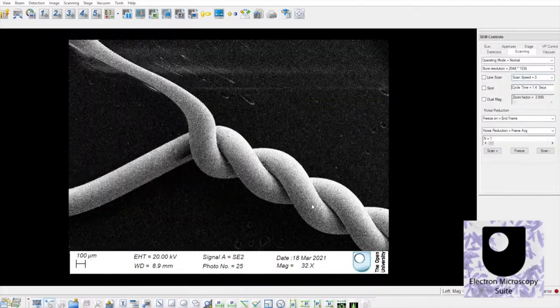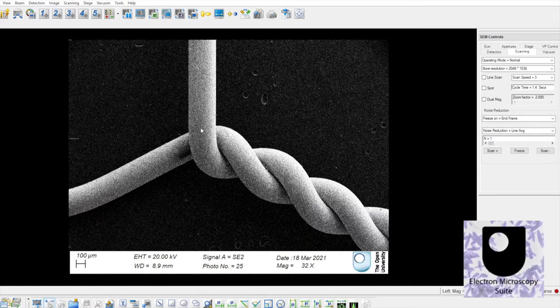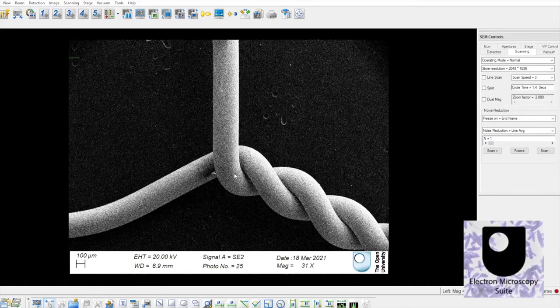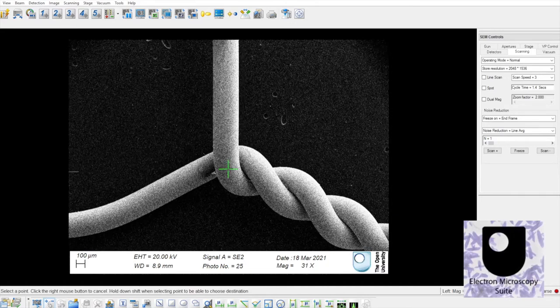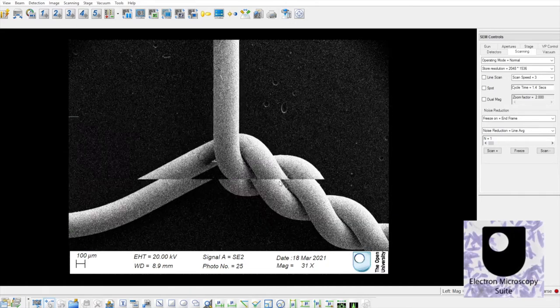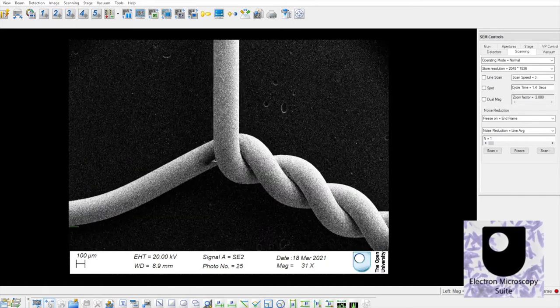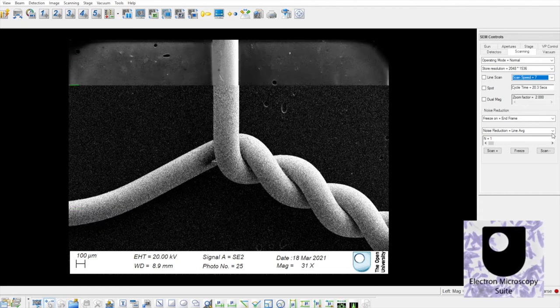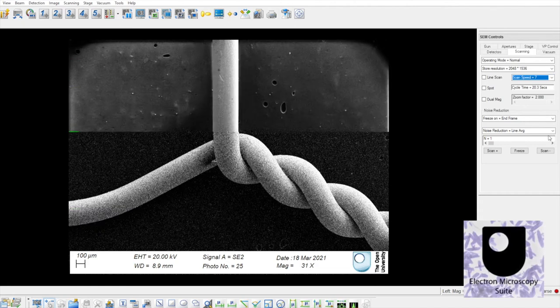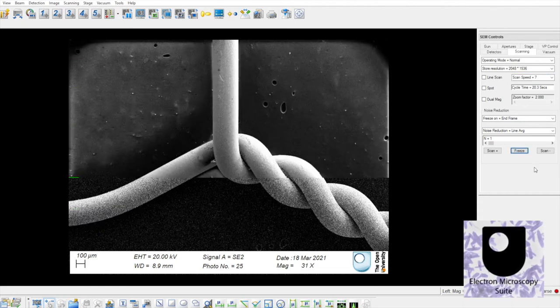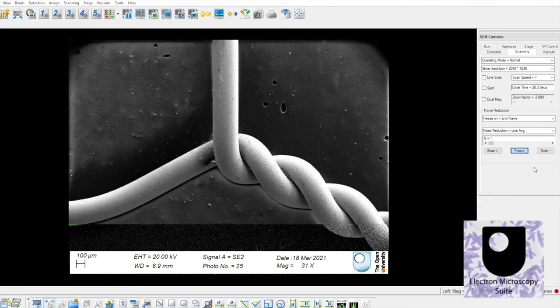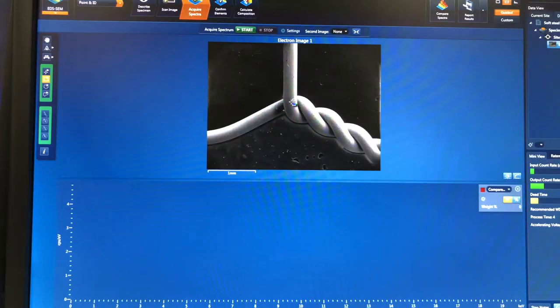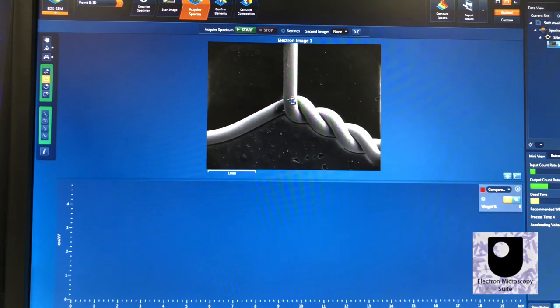High-speed, low-resolution images are displayed while navigating to a region of interest. After choosing a suitable magnification and focusing on the surface, high-resolution images are captured.